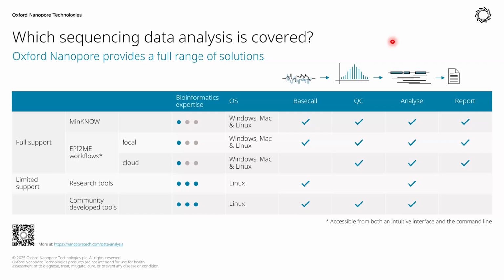So that would be done using the EPI2ME workflow when we want to do the alignment, or we want to get the gene counts. Let's say you want to do the variant calling or counts per cell, similar to how it's done in 10x. So we will have to run EPI2ME. This is what you are suggesting, correct?